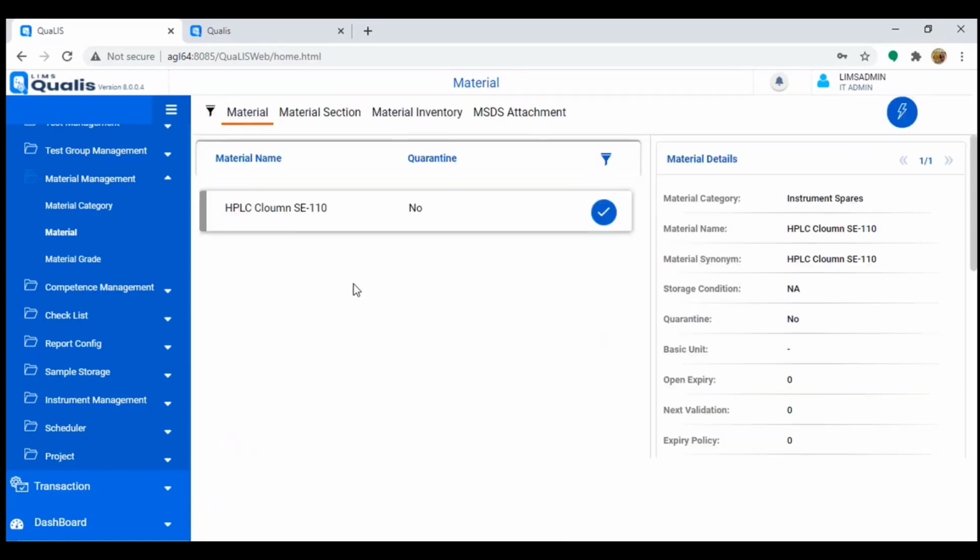Then users may use their own ERP or some other applications. Somebody is using an ERP and wants to do some information exchange between LIMS and ERP. We can build that bridge between these systems. Of course, it is configuration work and there are extra man-hours and costing involved. But yes, we have done ERP integration in our experience. It is possible.